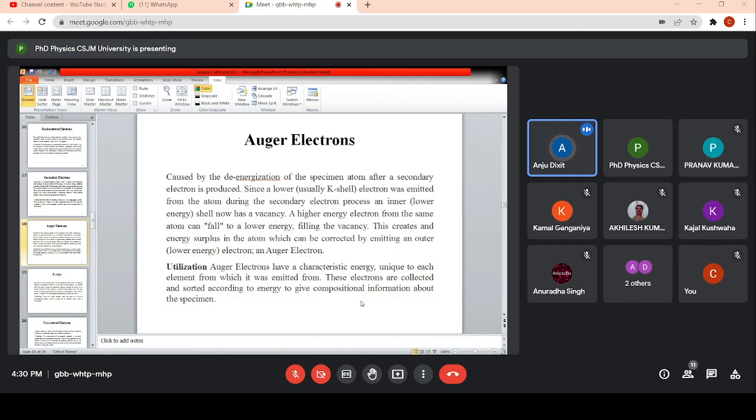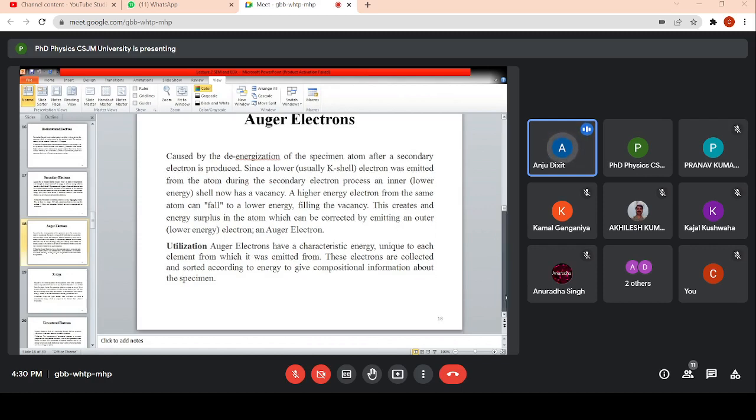So कौन से composition, क्या एलिमेंट प्रेजेंट है, इसकी हेल्प से ये इन्फॉर्मेशन मिल जाती है. क्योंकि ये जो Auger इलेक्ट्रॉन आपका सरफेस से स्केप करता है इसकी भी अपनी एनर्जी होती है. उस एनर्जी के अकॉर्डिंग आप वेवलेंथ उसकी निकाल सकते हैं. उससे आपको पता लग सकता है कि कौन सा कंपोजिशन आपके मटेरियल की सरफेस पे प्रेजेंट है.